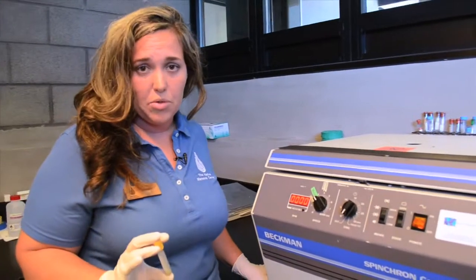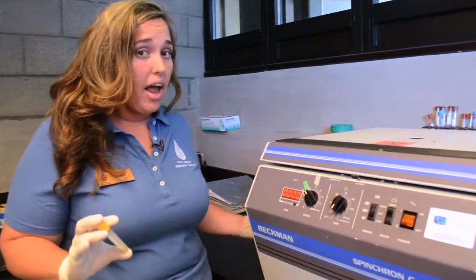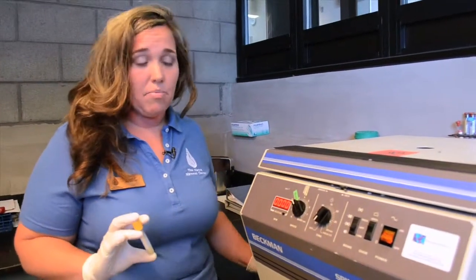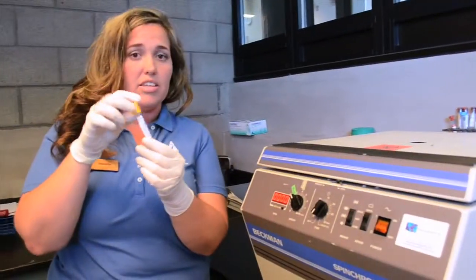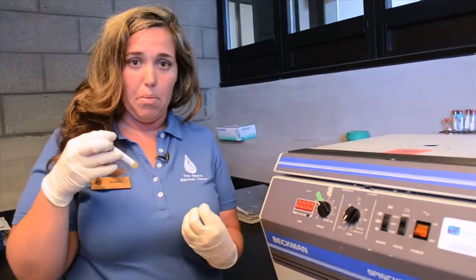Another test we do in our laboratory is to actually separate out the different parts of the blood. We use this machine here called a centrifuge, which spins around a sample like this and separates out those different components.